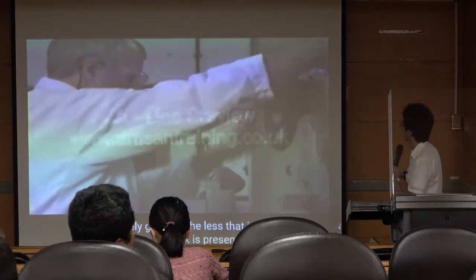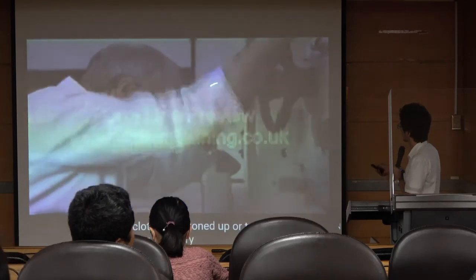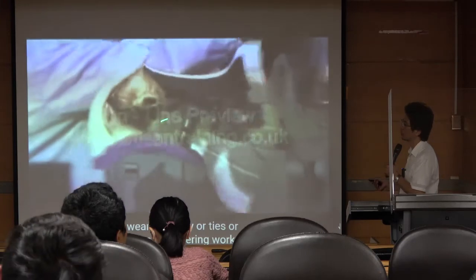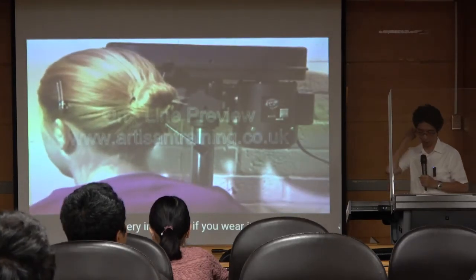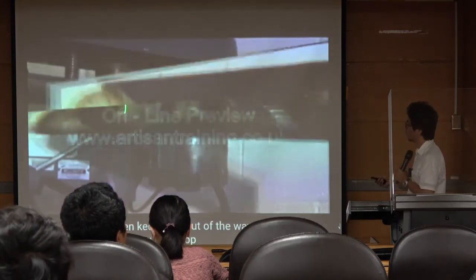Okay. Yeah, this part. Prevent your clothes from going into the rotating machines, especially hair. Girls, or men with long hair, tie up your hair.